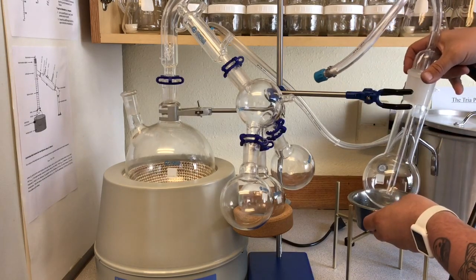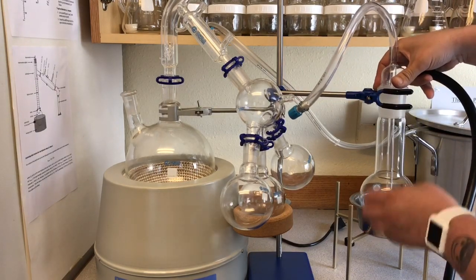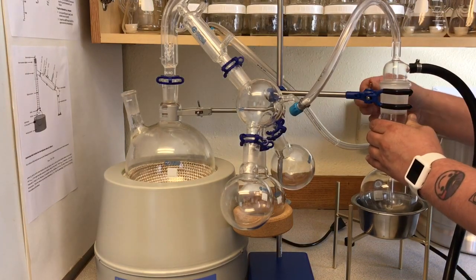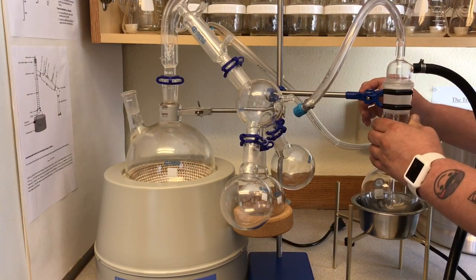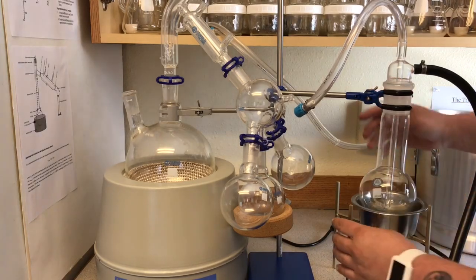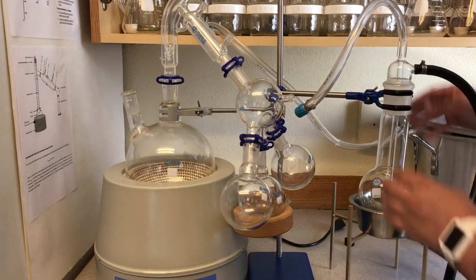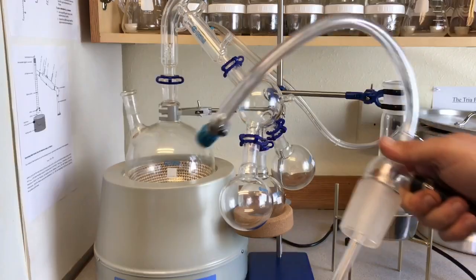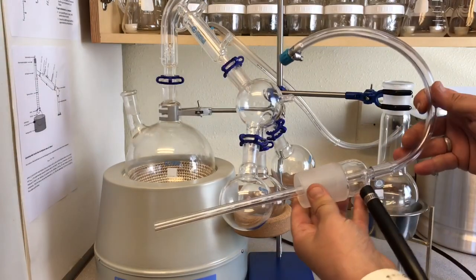And this little metal dish is to hold our dry ice. So we're going to take that little metal dish and we're going to fill it up full of dry ice. And this little stand just helps to keep it up where it needs to be at the correct height. So I'll just show you what this looks like.